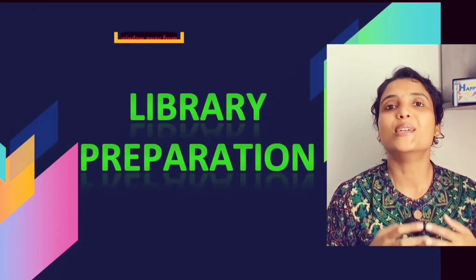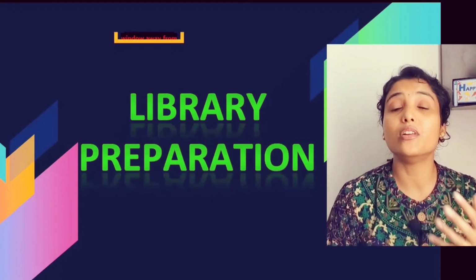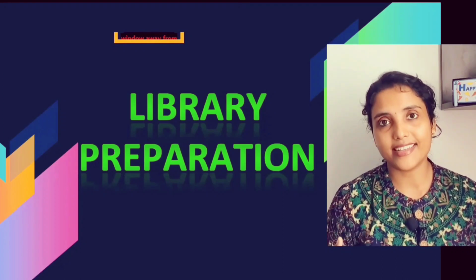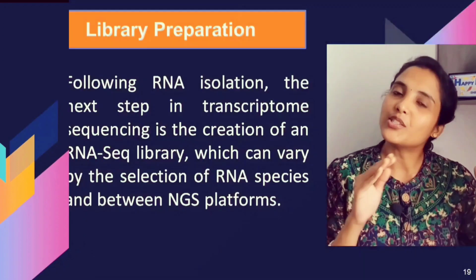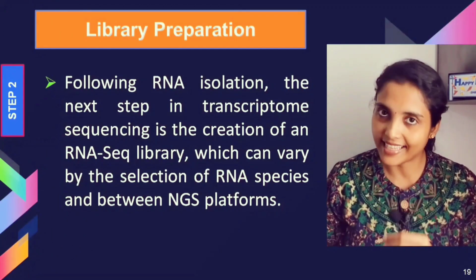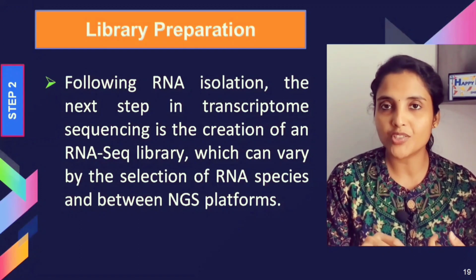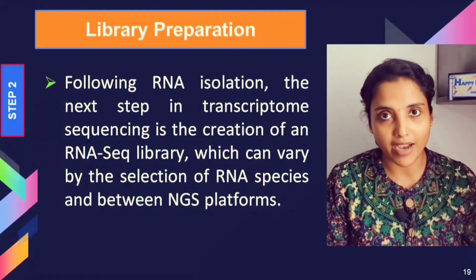Okay. So that was the first step, that is RNA isolation and enrichment, wherein you learned about the quality check also. The second step, or one of the major steps in RNA-seq, is the library preparation. Okay, so let's see what is library preparation. After your RNA is isolated, the next step is to prepare the RNA-seq library. Now, what protocol you follow for preparing this library will depend on which RNA species you are selecting. For example, is it mRNA you're working with, or are you working with microRNA?